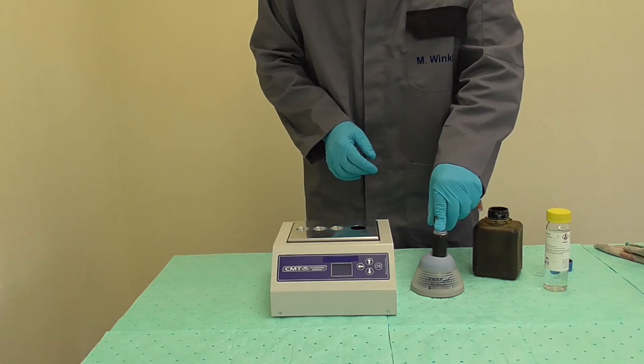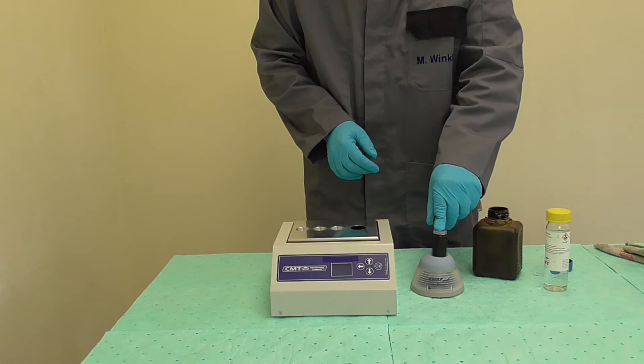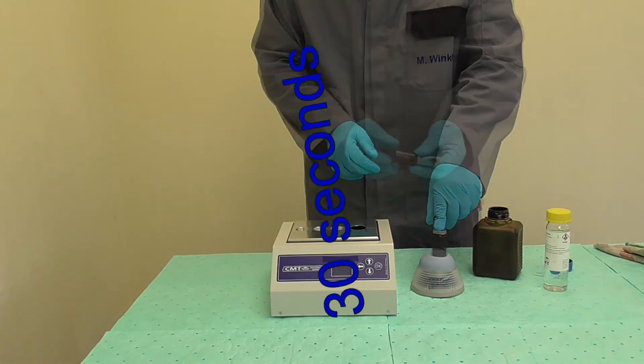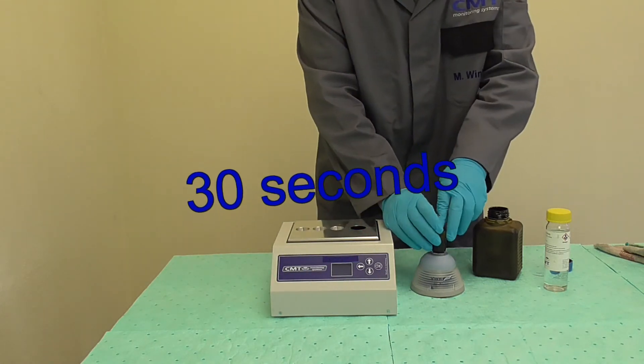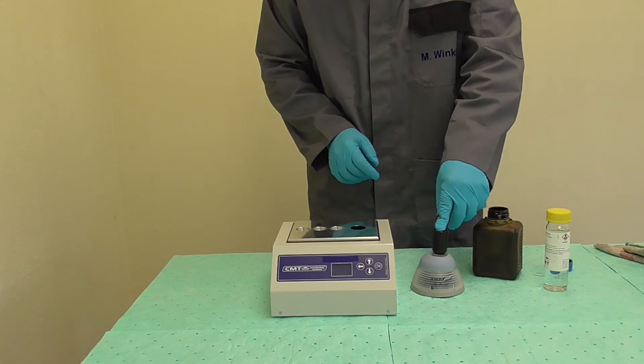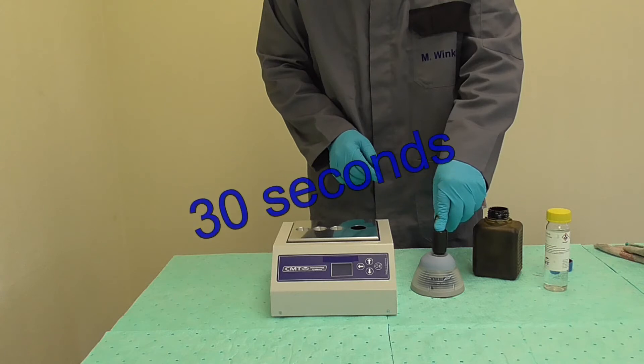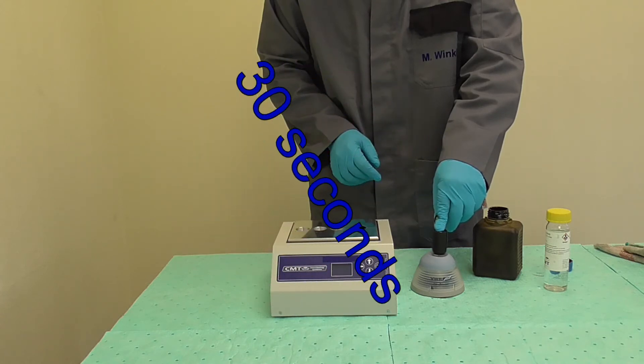Use your index finger only on the vial's top to hold it in position. Turn the vial upside down after 30 seconds. You need to press firm enough to ensure good mixing. The contents of the vial should appear as a homogeneous black fluid after mixing.